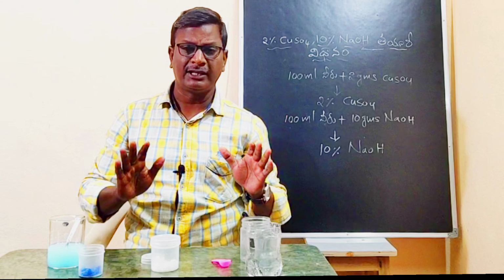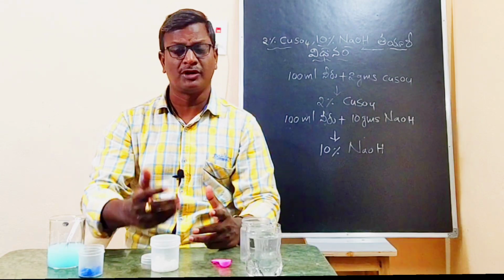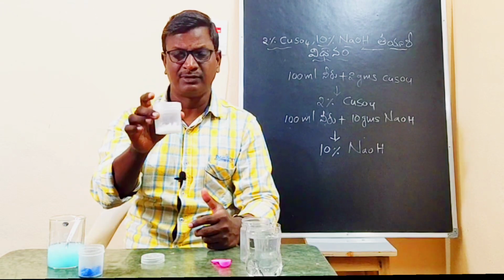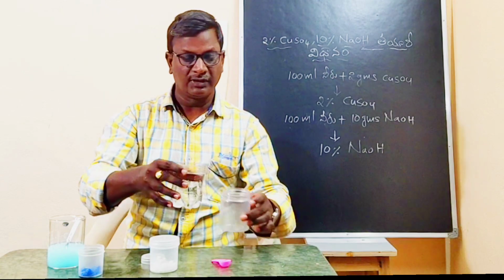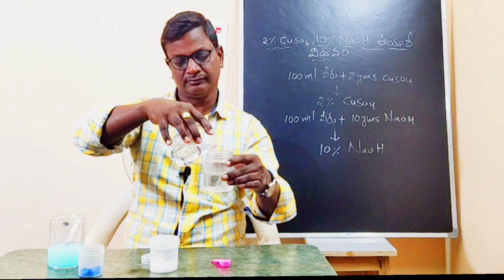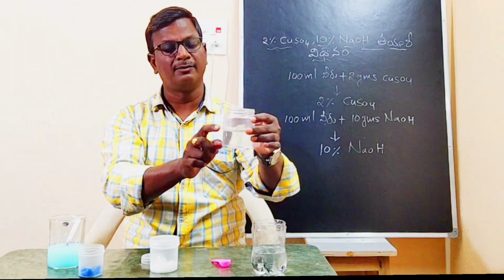Next, I am preparing 10% sodium hydroxide solution. How to prepare 10% sodium hydroxide solution? 10 grams of sodium hydroxide pellets should be dissolved in 100 ml of water. I am taking 100 ml of water. I put one mark. This is the 100 ml of water.